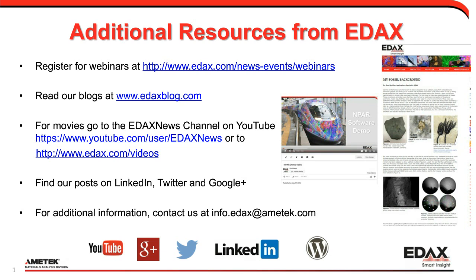All right. That pretty much, I think, answers the questions that would be of general interest. There are still a few that I will go ahead and respond directly to you on. There was one question on the simulations in terms of the software itself. So we are using what's called the EMSoft, which is available open source, but we've implemented parts of that into our OIM analysis software, primarily to make it more convenient for the user and using data collected on either our OIMDC or TEAM software, because it's all linked together and flows well.